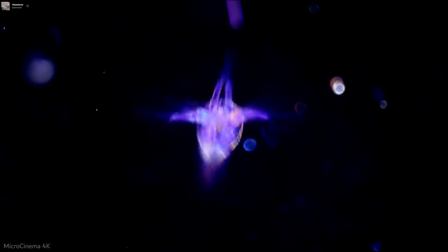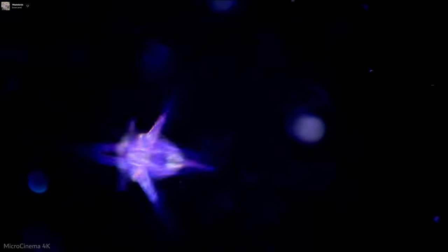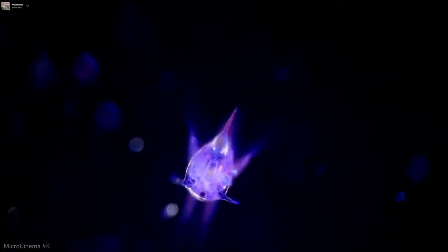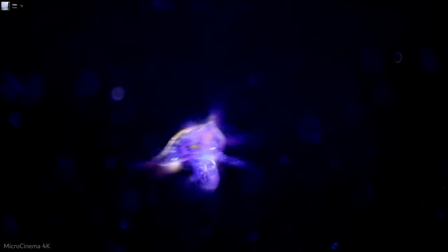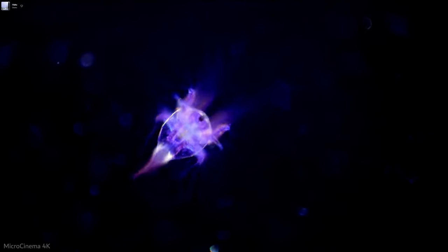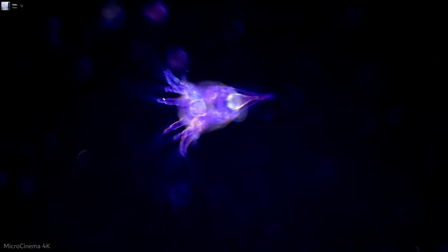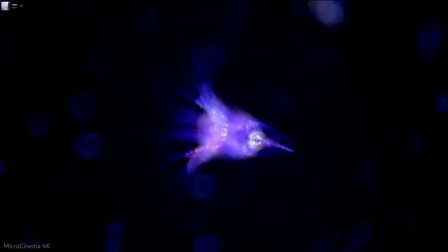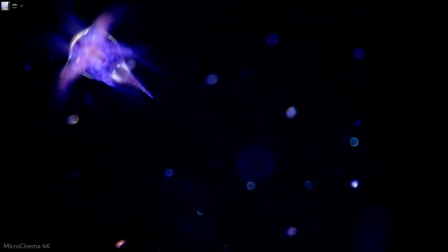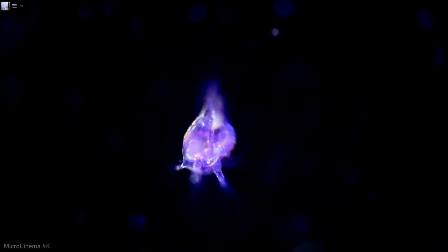But if you're just observing, one thing you might want to consider doing is turning out the rest of the lights in the room so that your eyes can really adapt to the darkness. Watch these things in the dark and your eyes should be able to detect it just fine. And it looks amazing, by the way. One of the things that I really want to stress is that no matter how good the video quality is here, there's really no substitute for just looking through the eyepieces, especially with these polarized light techniques. They have so many beautiful colors, and no display can fully replicate the subtle beauty of these colors.